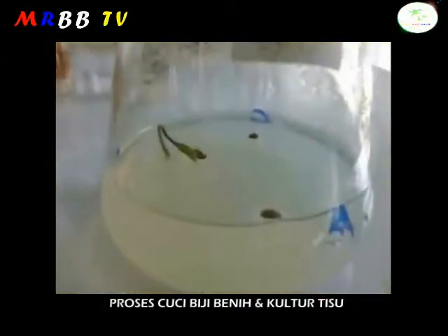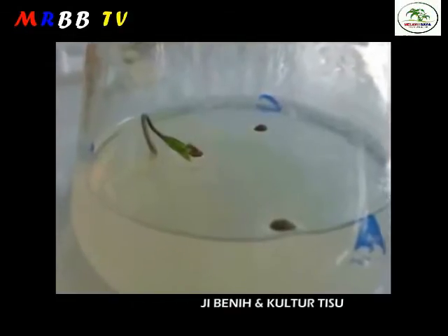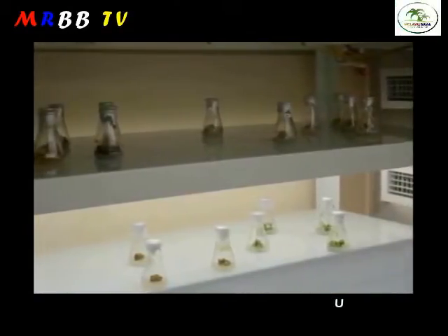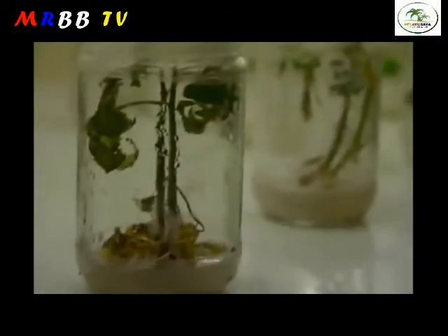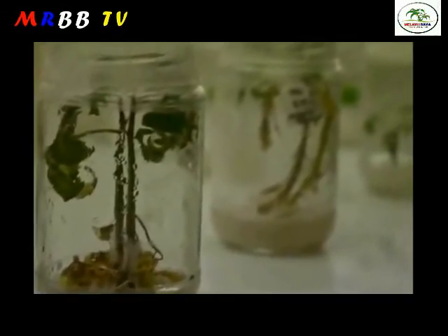Then, seeds are inoculated into a conical flask containing the media. The flask containing the seeds is incubated in a well-lit area. After some period of incubation, seed germination is to be expected. Further observation can be made on the morphology of the plant after a few weeks.